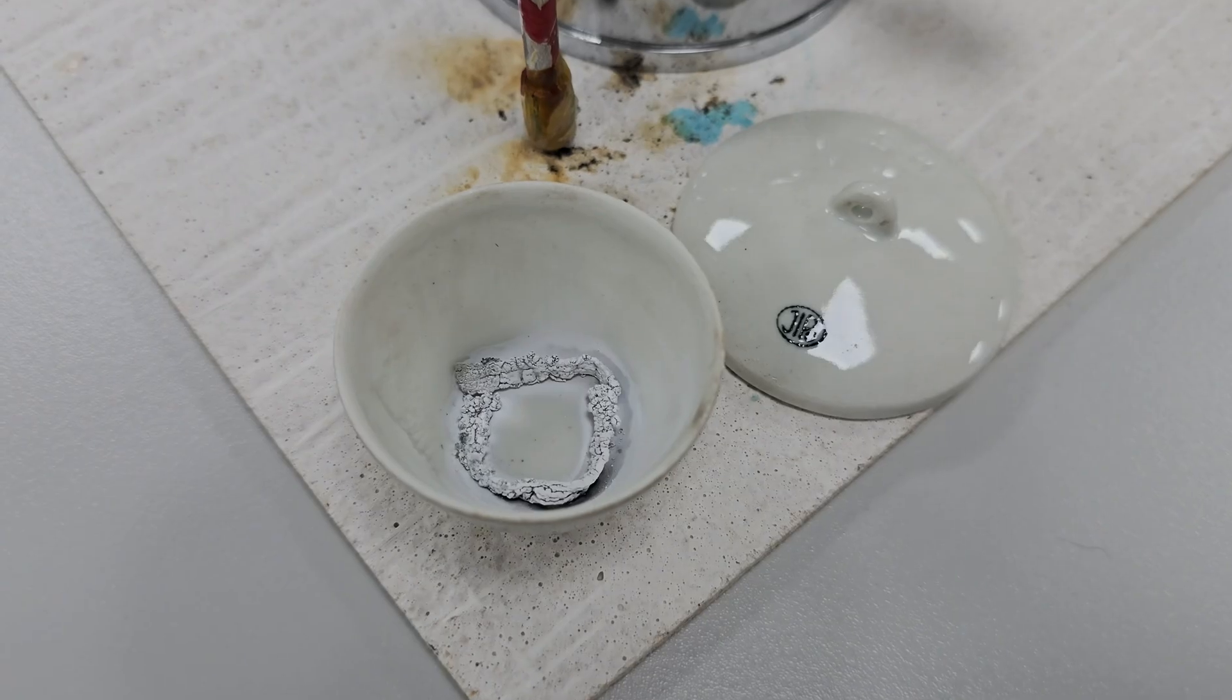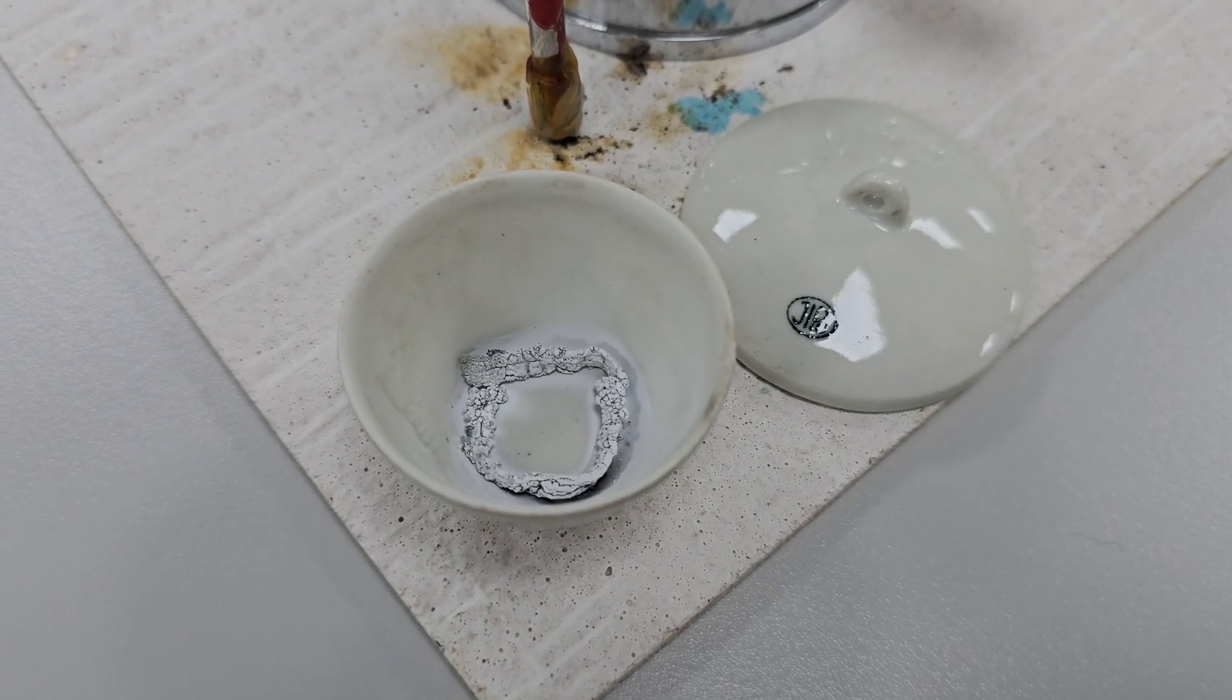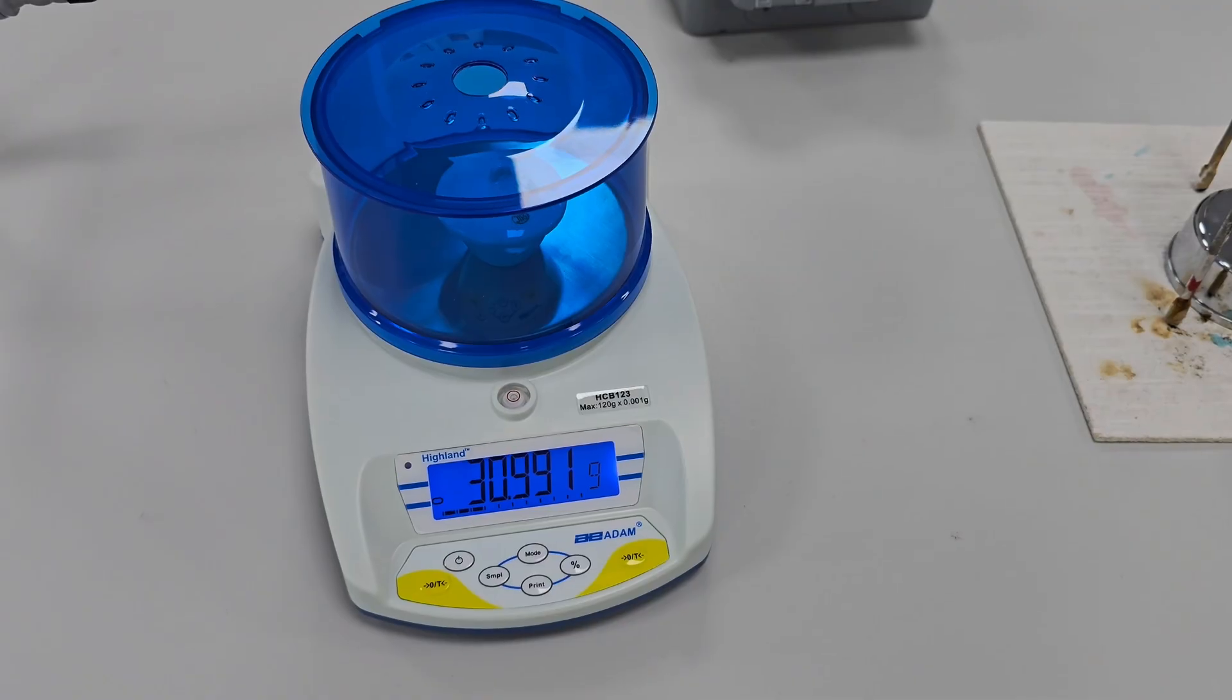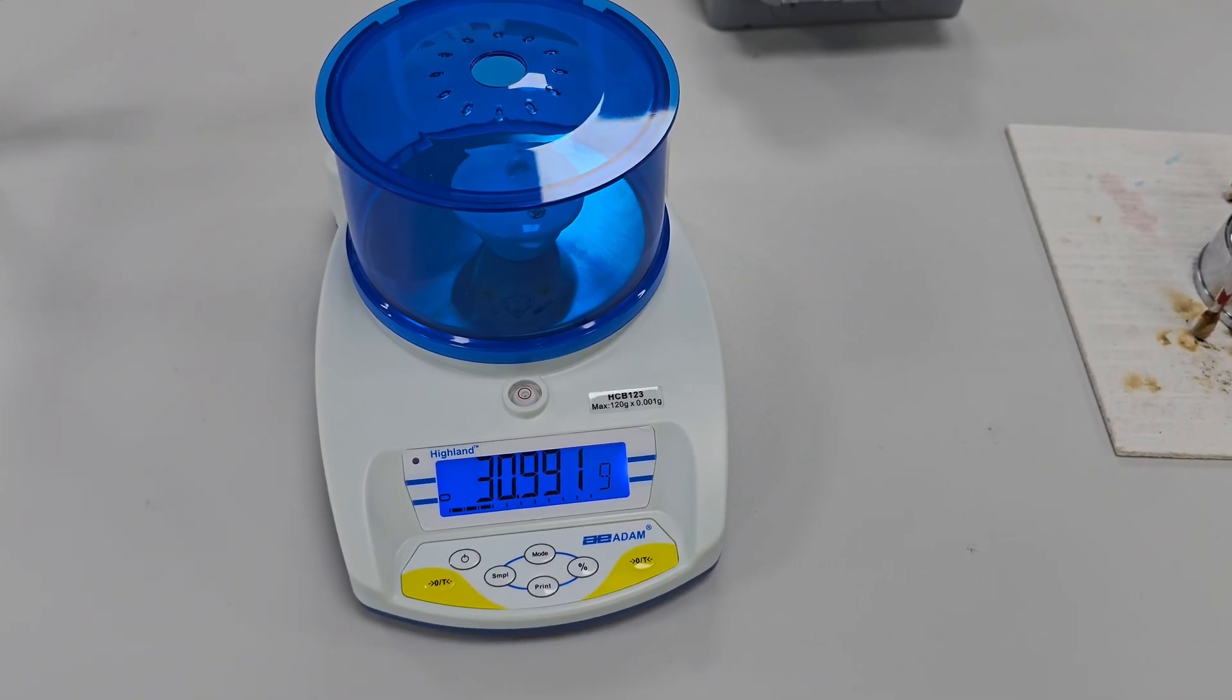Now that the crucible has cooled let's check the final mass of the crucible with the magnesium oxide. The combined mass is 30.991 grams.